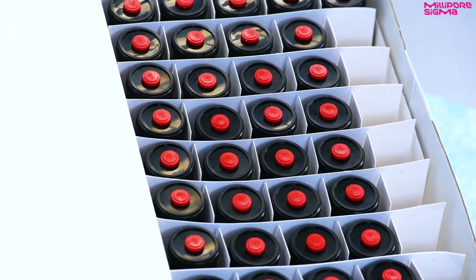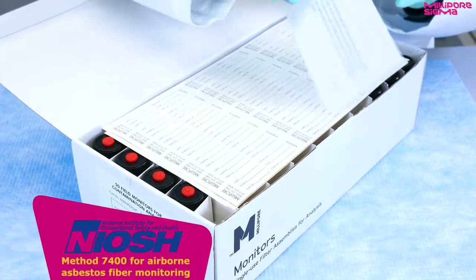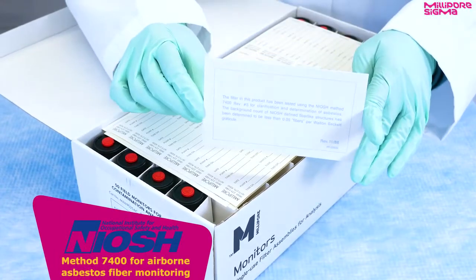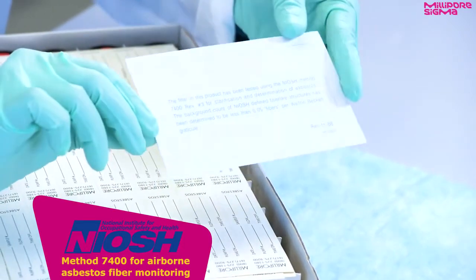These are 25mm air monitoring cassettes for asbestos monitoring. These monitors meet specifications of the National Institute of Occupational Safety and Health Method 7400 for airborne asbestos fiber monitoring.